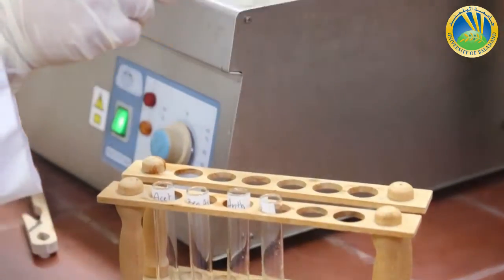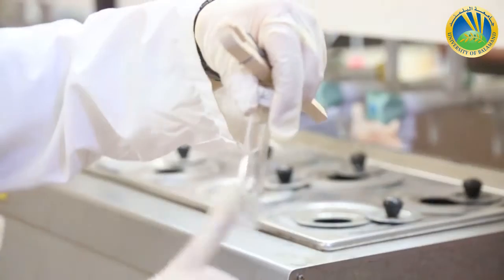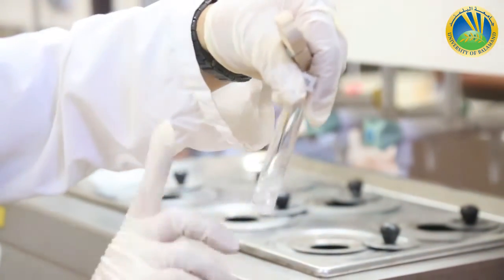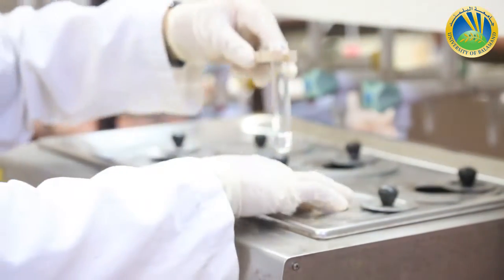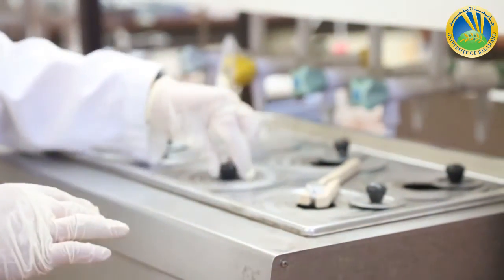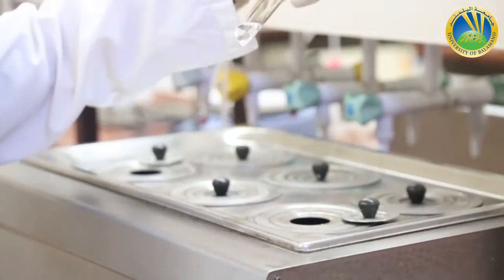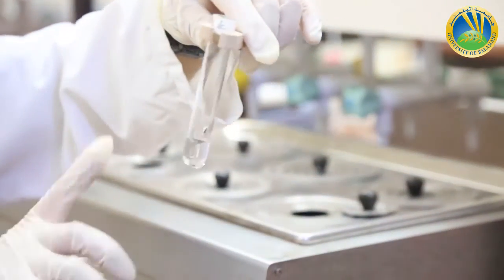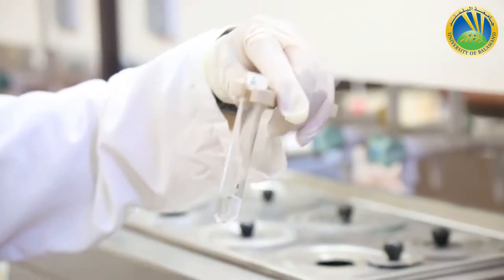Stearic acid at cold, petroleum ether, it's not soluble. Let me check at hot. Stearic acid has totally dissolved inside the petroleum ether at hot. There is no more crystals. Now we are done with our tests.